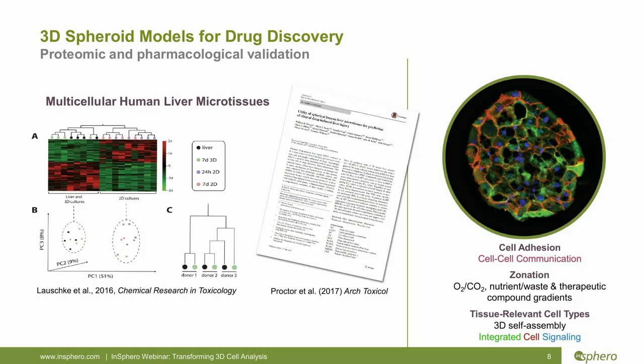They examined 110 clinical compounds in human 3D liver microtissues and found that the liver model was twice as accurate at identifying drugs that cause drug-induced liver injury in the clinic than the 2D primary hepatocytes. So not only are multicellular 3D spheroids morphologically and functionally more similar to native tissue, but they can also respond to drugs in a more physiologically relevant fashion.